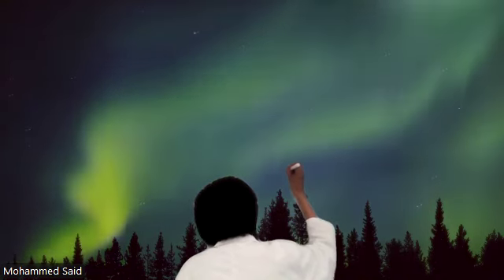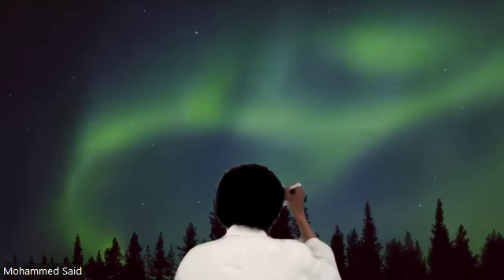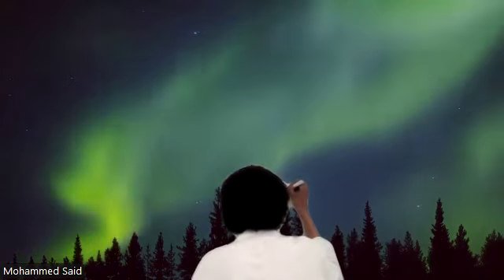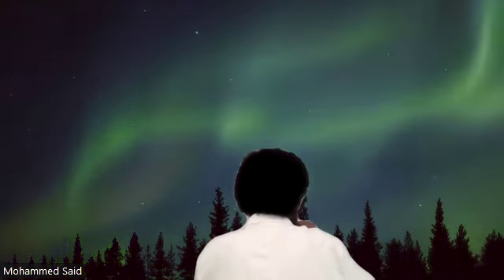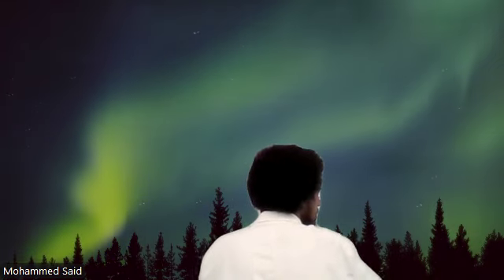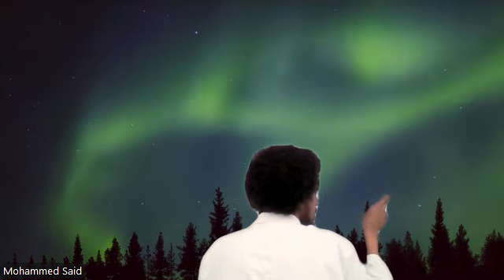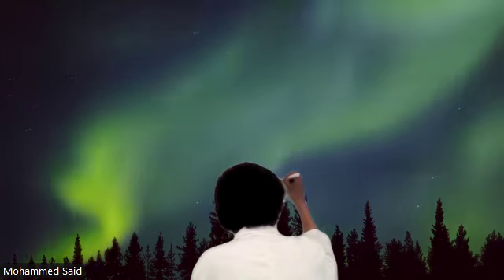So that's EX1. Let's say today's date is maybe 20. So we're at 20. I said bacteria, and there was something else. Okay, we'll say bacterium. So hypothetically, it's E. coli.